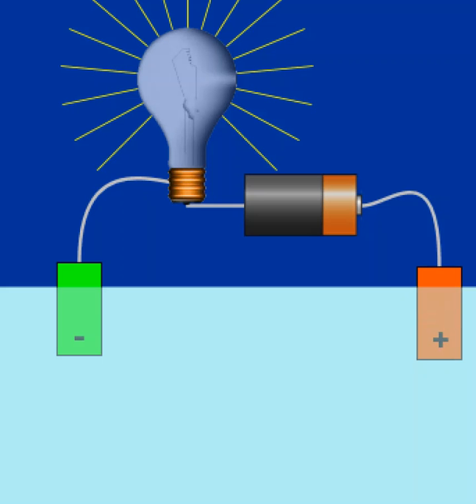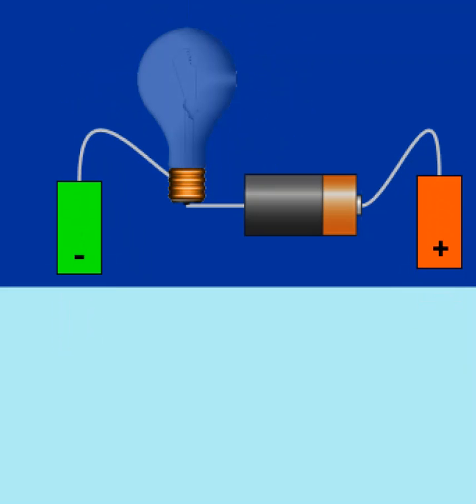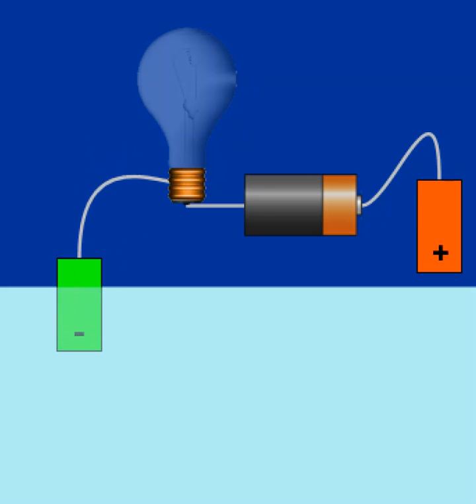Okay, so let's go to the 0.1 molar, and as you know, 0.1 is less concentrated, so that's going to mean there are fewer ions floating around. Let me switch to my 0.1 molar. Okay, I've switched to the 0.1 molar sodium chloride, and like we said, it's a lower concentration, so there are going to be fewer ions that are floating around.